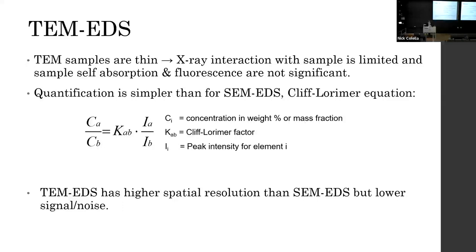Having said that, the downside is because you've got a thin sample, you've got a lot less material, and so your signal is less. So, okay, it's easy to quantify, but you've got noisier data. I don't know whether you gain there or not. It depends on your application and the question you're trying to ask.